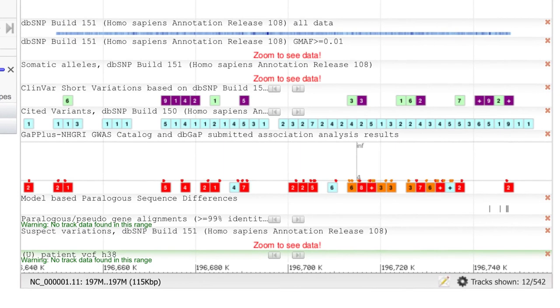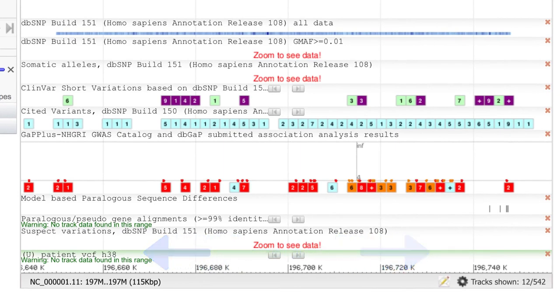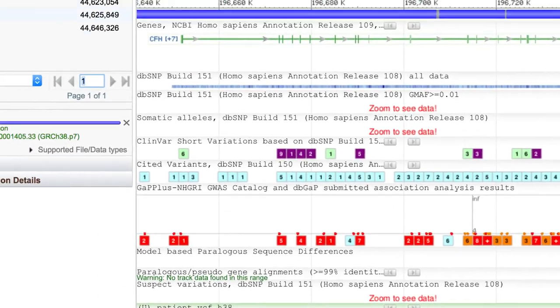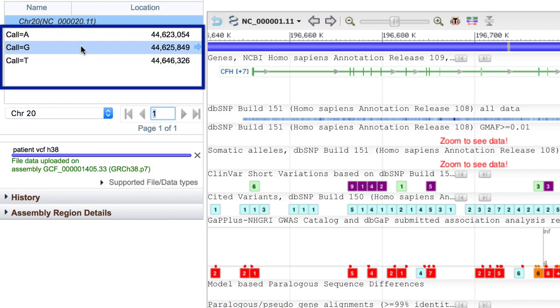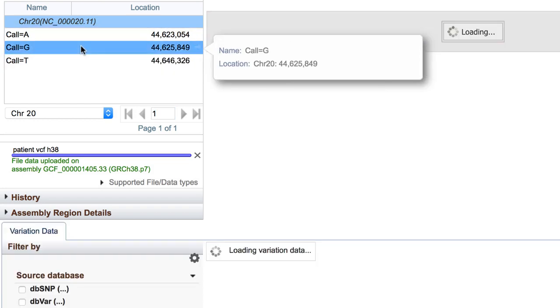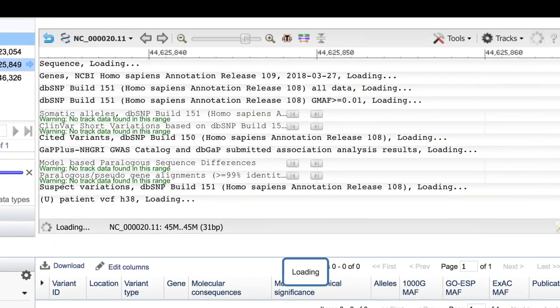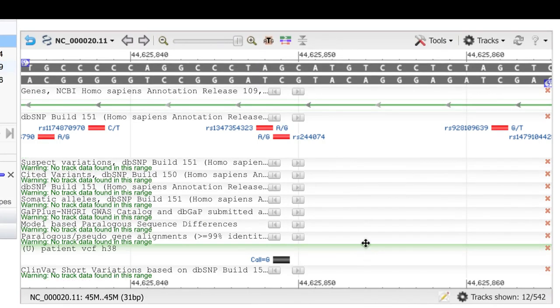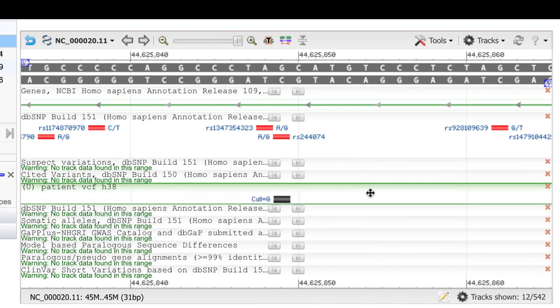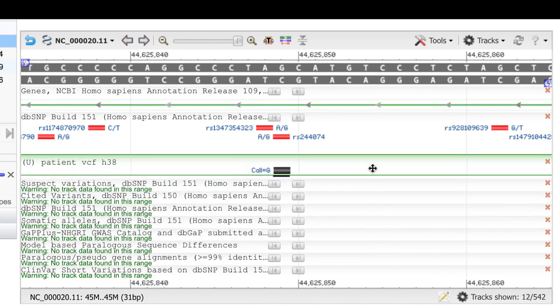You now see the VCF track with a green highlight, indicating that this is user-supplied track data. In the widget, we see the three variant calls. Let's first explore the called G. Click on that row, and the display zooms to that region on chromosome 20.